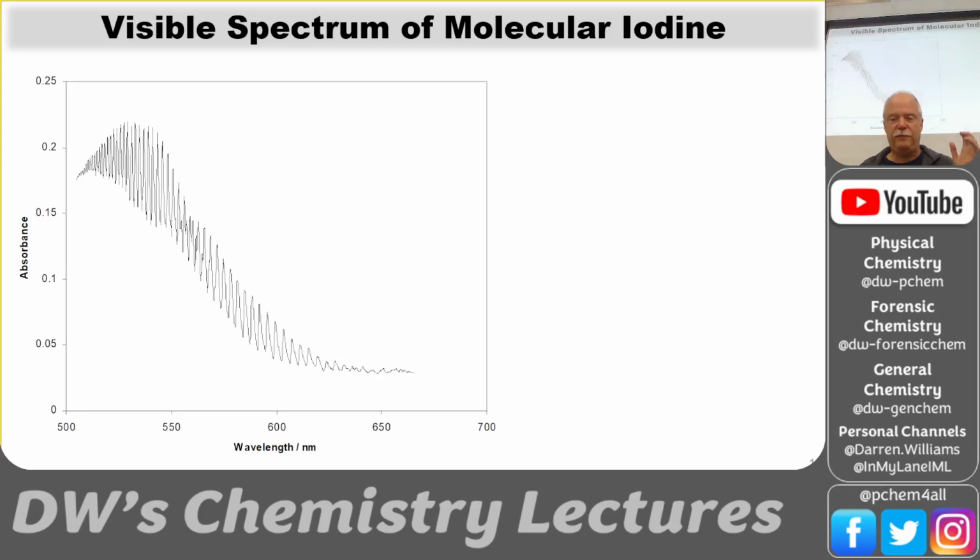So now let's figure out how to assign this spectrum. So here's the spectrum that you're going to get. And like I said, it took about 30 minutes to get. You scan the spectrometer very slowly, and if we were sitting up there in the lab on the floor, it would just be going about this fast. It just takes forever. And you just see the screen, and you see this little plot come out.